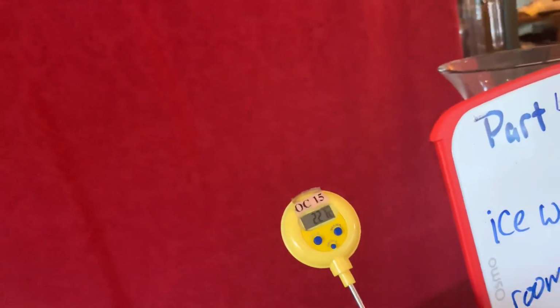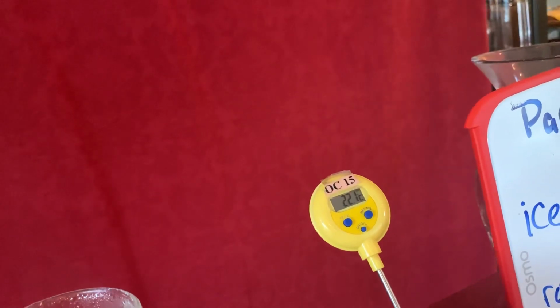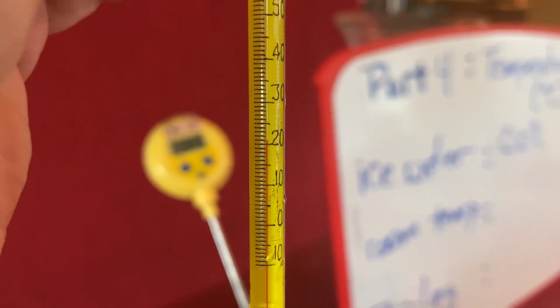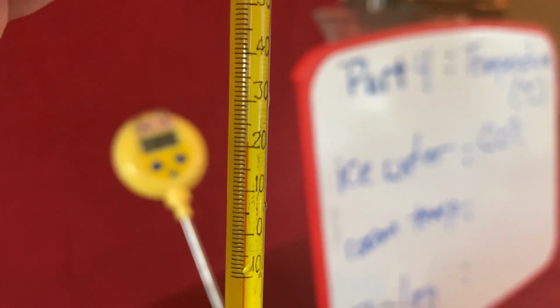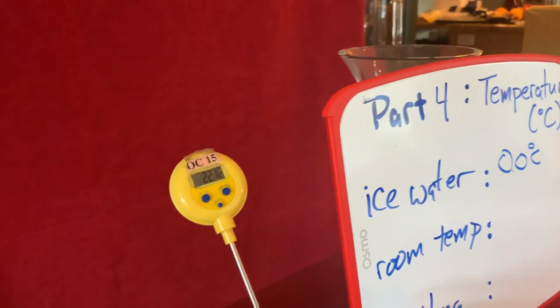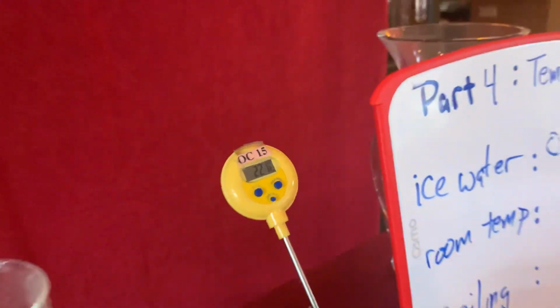.2 degrees Celsius. We're gonna let that sit a minute, and while we can, examine where our alcohol thermometer has gotten to. You see right there, it's changed just a little bit, 22.1. Our alcohol thermometer is showing us a temperature of approximately 21 point, just about a little over 21 before I took it out of solution. So you see that there's a little discrepancy between these 2 thermometers. Our digital thermometer seems to have settled on 22.1.